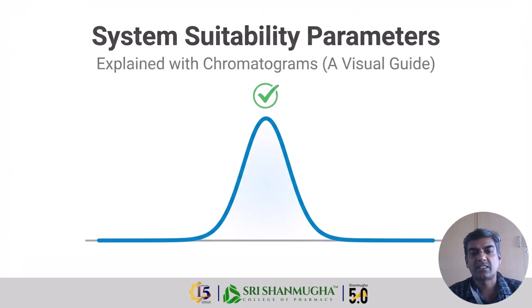Okay. So in this session, I will show you how to read chromatograms and understand whether your HPLC system is ready or not. By the end of this video, you will be able to look at a peak like this, which is shown here, and immediately understand what it is telling you. So let's start step by step.